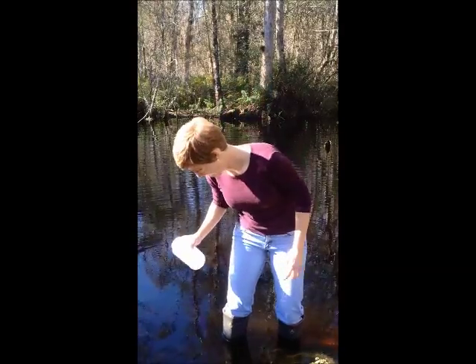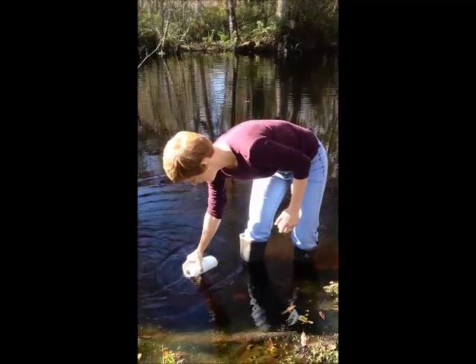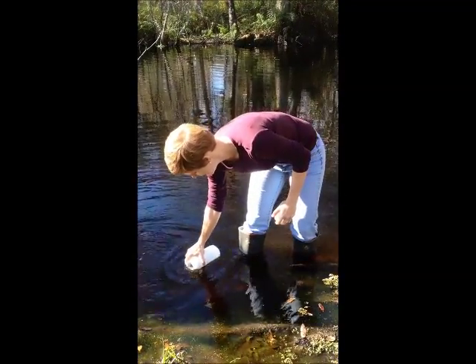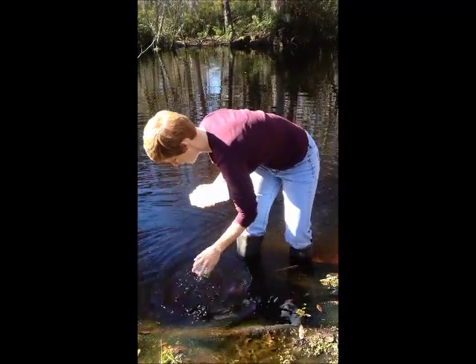At your location, with your 1 liter container, fill it about a third of the way full, swirl the water around, and dump it out. You'll need to do this three times. Then do the same thing with the lid, dunking it in the water and rinsing it three times.